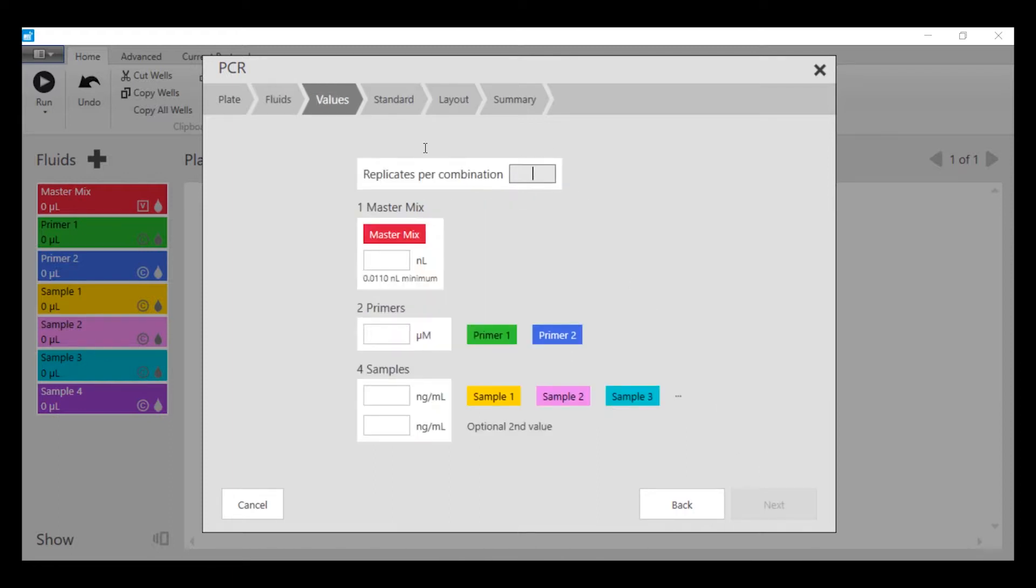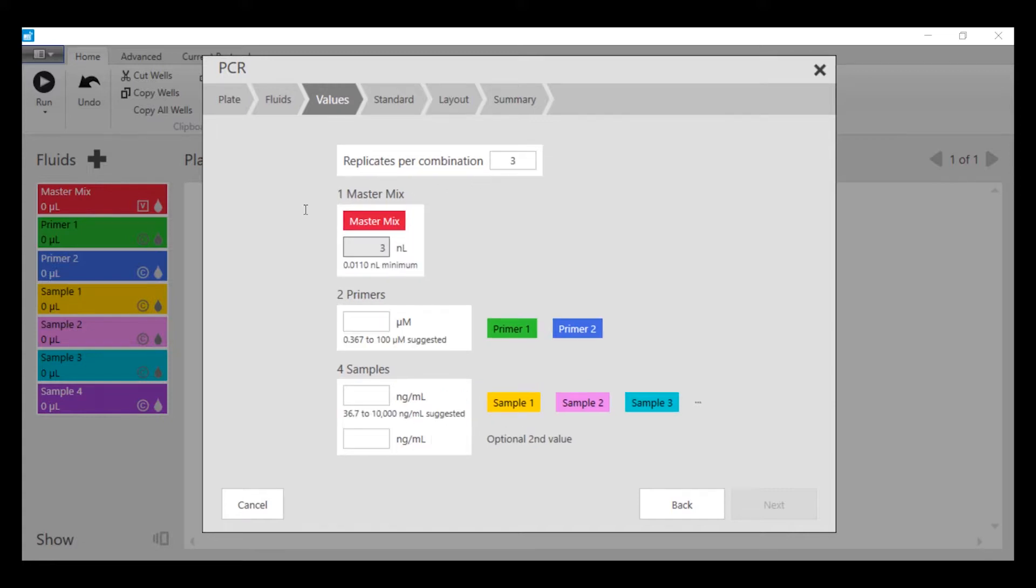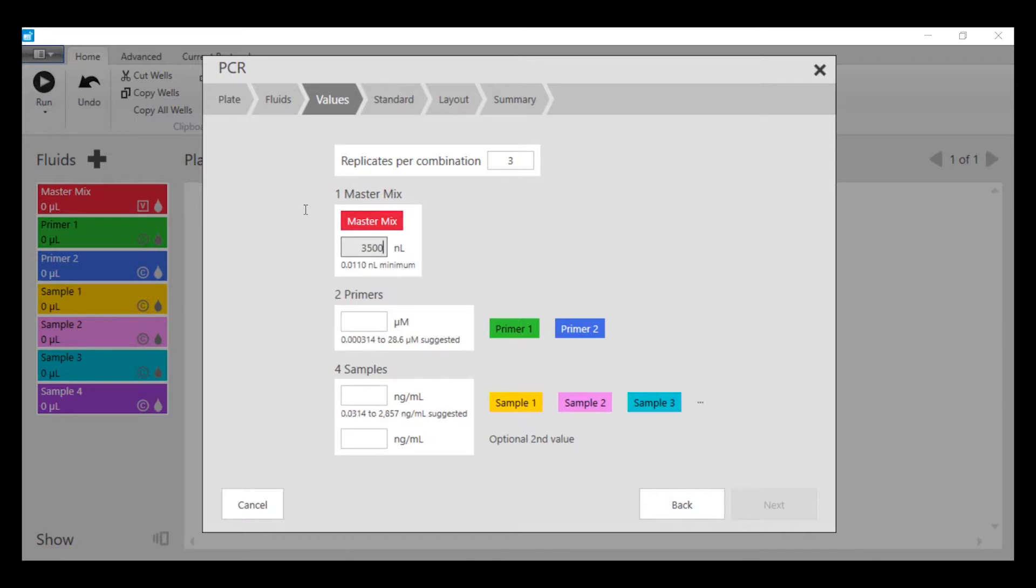We're going to do everything in triplicate. We're going to set the master mix at 3.5 microliters or 3,500 nanoliters. We're going to use primers at 1 micromolar from their 100 micromolar stock. We're going to have the samples be present at 1,000 nanograms per mil in the final qPCR assay.